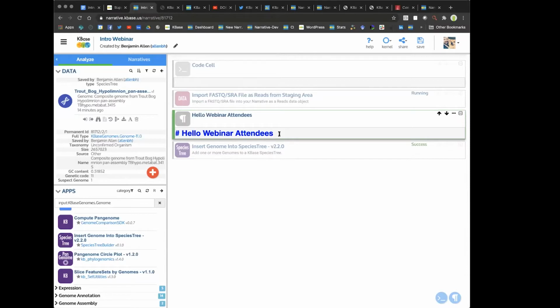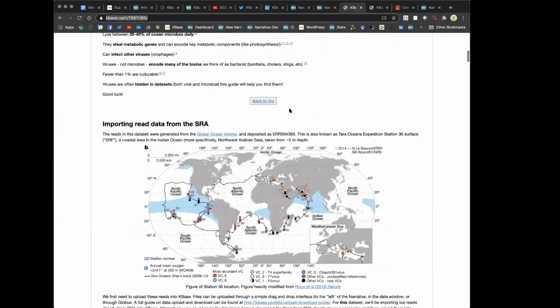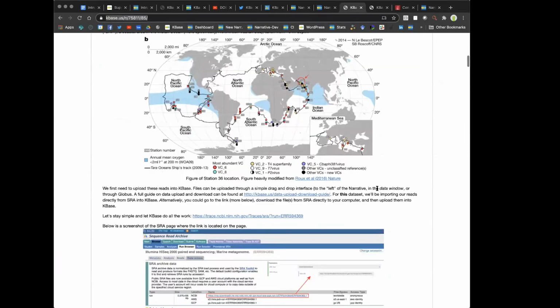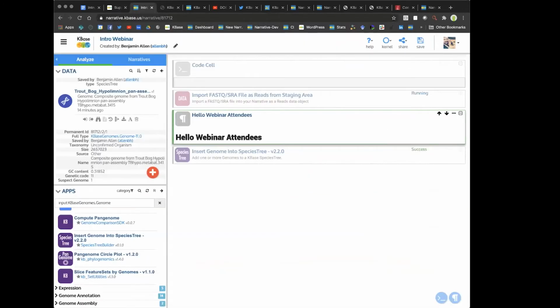We've got some examples of using Markdown in our documentation page, but yeah, you can basically write whatever text, put graphics, as I showed in this static narrative, an example of somebody really using this to the max, and providing links and graphics and things like that. So you can put whatever you want there using this button at the bottom, add markdown cell.